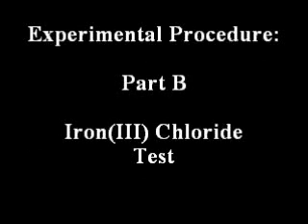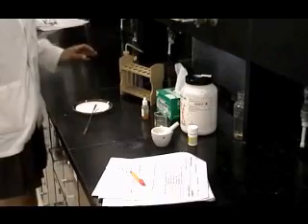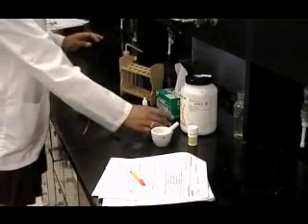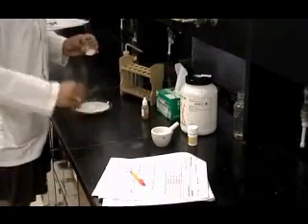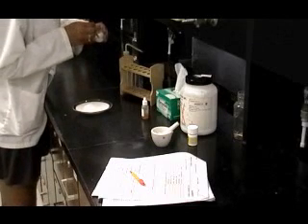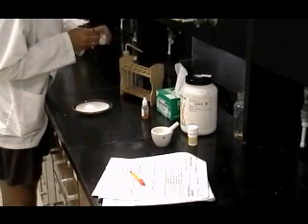The presence of unreacted salicylic acid in the synthesized aspirin can be detected with the iron-3-chloride test. Begin the test by adding about 20 drops or one milliliter of deionized water to each of four clean 10-centimeter test tubes. Using a clean stirring rod, place a few crystals of salicylic acid into the first test tube.